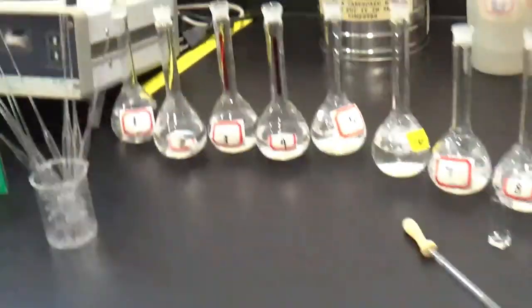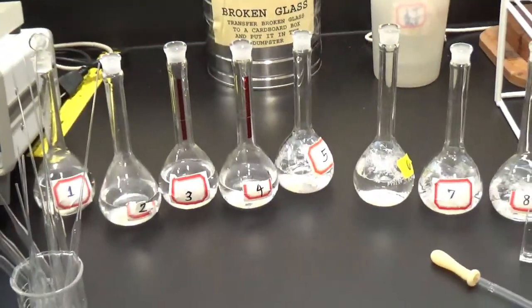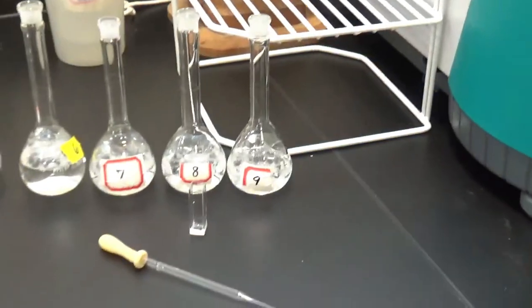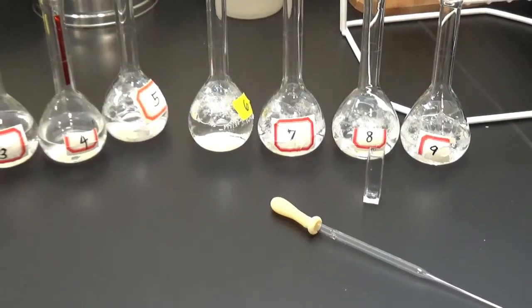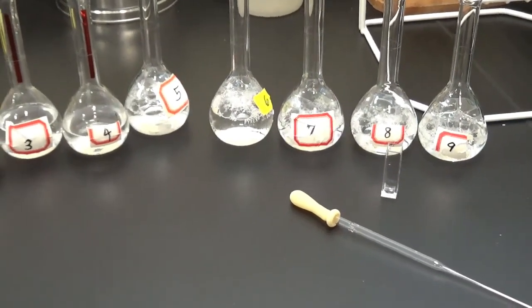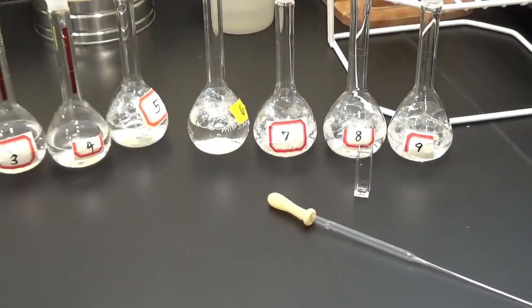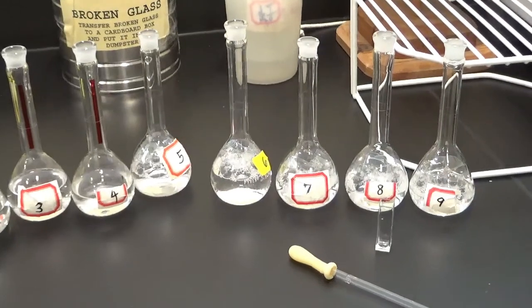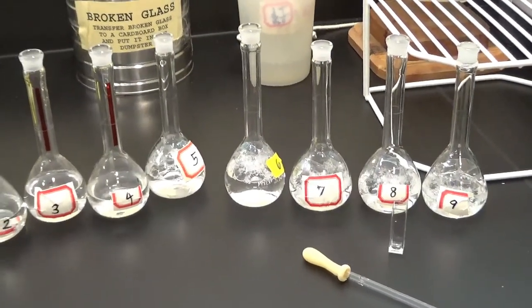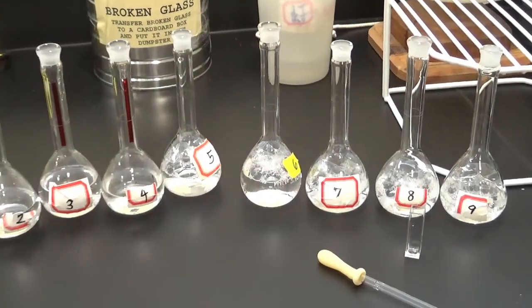Okay, so basically what I'm going to do is rinse that cell with solution 1, put solution 1 in it, measure the fluorescence intensity, and that will be the maximum fluorescence intensity. So I'm going to try to adjust the parameters so that that first solution gives me a fluorescence intensity that's near 1,000 but doesn't go over it.